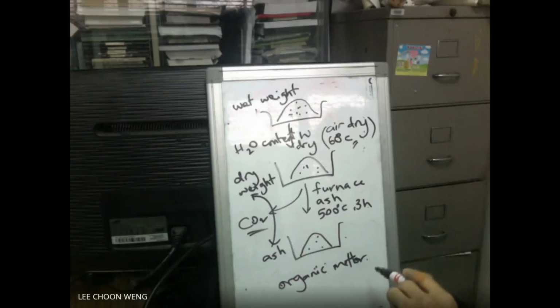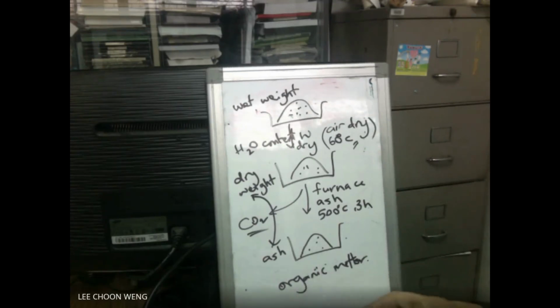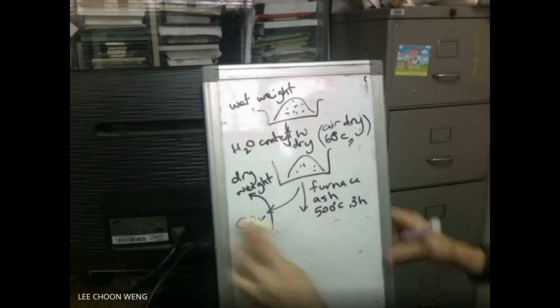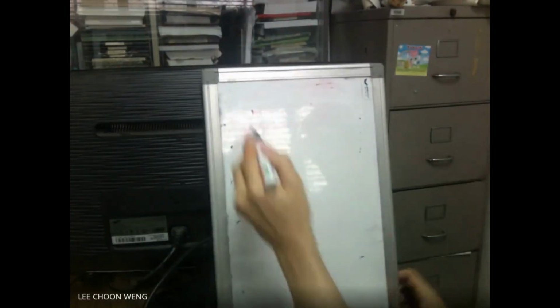Yep. Okay. So when we are doing the soil respiration experiments, the students will be asked to collect the soil sample, measure these basic parameters, and then carry out the respiration experiments, and then analyze to test the hypothesis. So what kind of hypothesis can we test? Basically we can test the following.